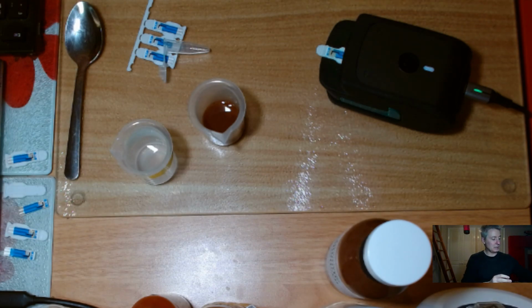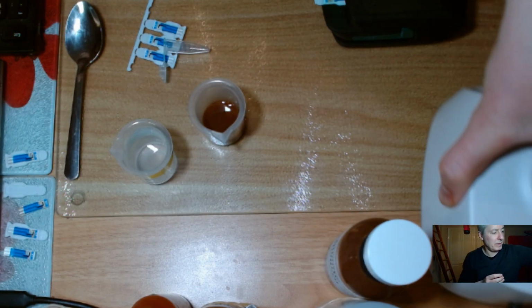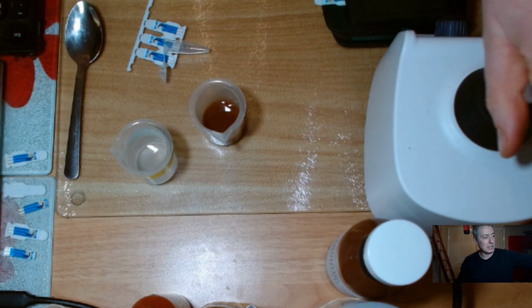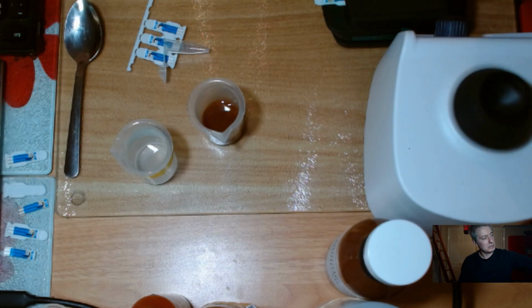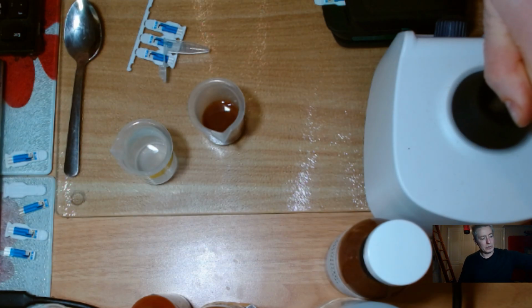I'll bring those slightly to the side here. I'll vortex it just very quickly, well, about 30 seconds. Give it a little shake.